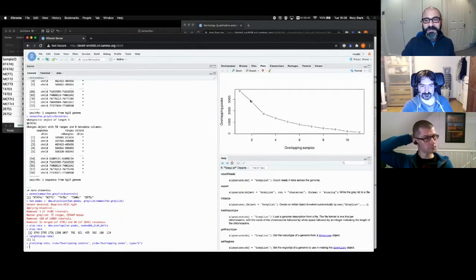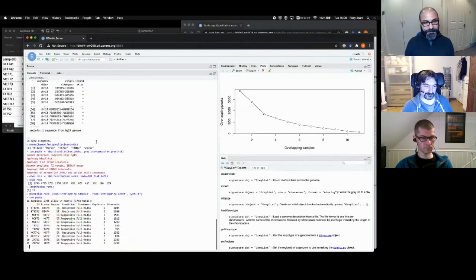We found that if you just go to 2, at least identified twice, that works well. Again, you should have several replicates. I'd say the minimum experiment you should be looking at would have 6 samples, so that you get a good universe of peaks and a good result. That's the default, and that's why when I look at the consensus peaks, I'm getting 2795 as the default, right? So this 3743 is all of them, and this 2795 is that. This is what we call the overlap rate. So we say it's an overlap rate of 2.